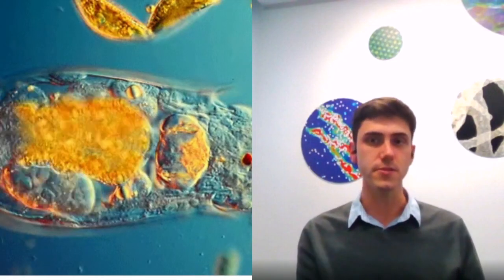You mentioned you study ice. Why do you have to study ice? I mean, we know what ice is. What are you going to change in the ice? Amazing question. I'm studying ice using the atom probe microscope, not because ice on its own is particularly exciting, but because ice is the environment where biological materials live.